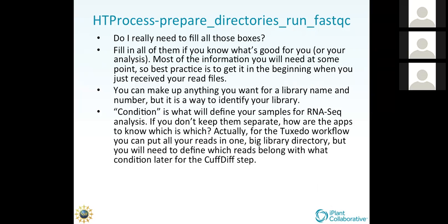I should also say at this point that it's important to consider how you're going to use this set of tools. I've designed it so that you're dealing with the read library. This may be annoying to some people because they may just want to put all the reads in one box and that's it. But chances are, if you're doing a larger project, not all your reads have the same properties. If you've had two different sets of paired reads, that is with different spacing, this is a good time to separate those libraries and record that information in each one, capture that, and pass it on.